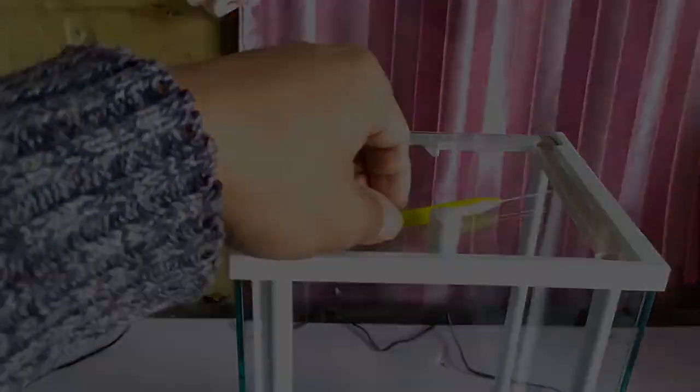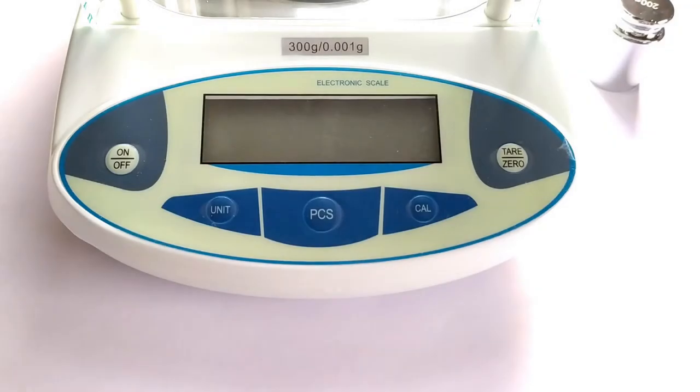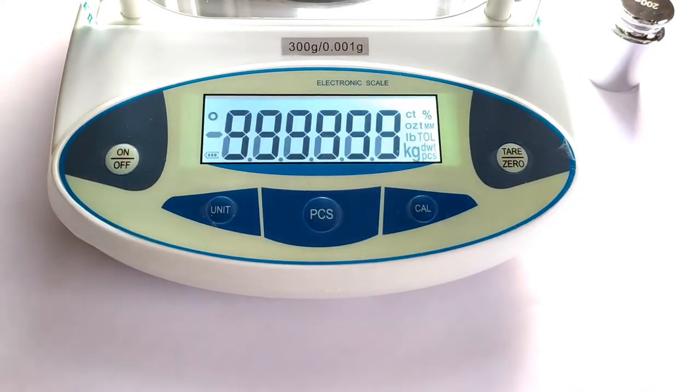Anyways let's move on with the review. The weighing scale is now perfectly leveled on a horizontal plane using an external separately bought leveling gauge. We now turn the power on and allow the machine to warm up for 30 minutes.